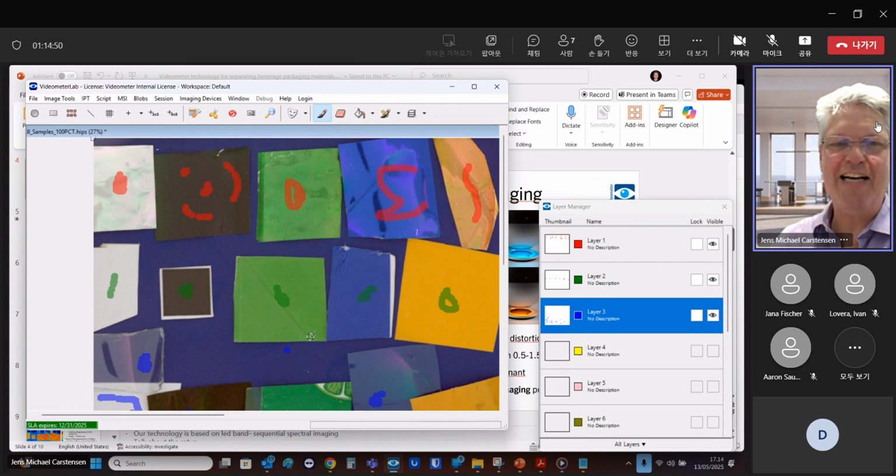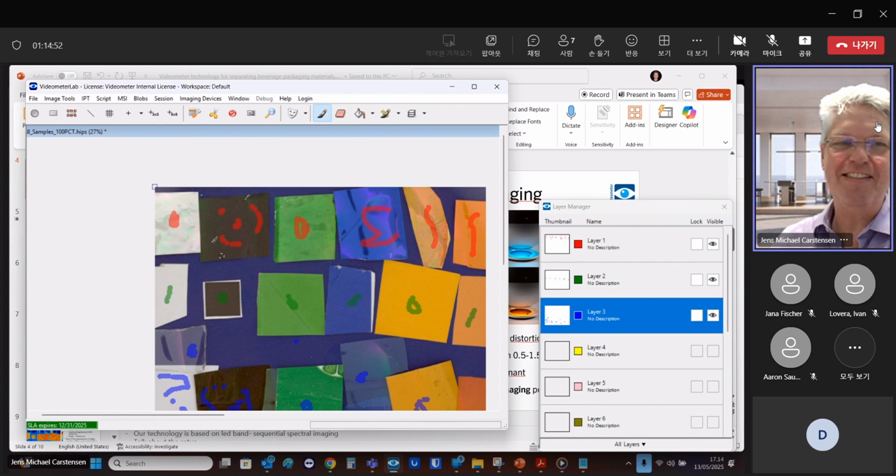So these are different materials. The top row is metal, so it's beverage containers, so pieces of metal cans, aluminum painted with different colors. And these are liquid packaging boards, so these are like juice and dairy containers.